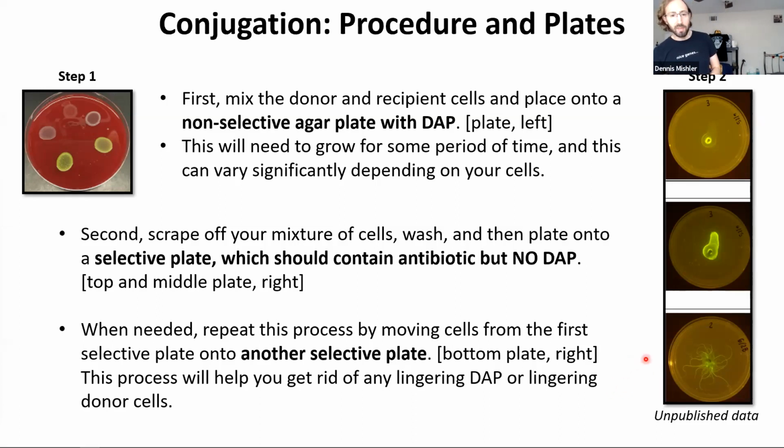This conjugation procedure, what my students did, probably took them about a week to conjugate. But none of our transformation procedures work, so that was the only option they had. Transformations didn't work, so we had to conjugate. It takes longer, but hey, we got a good result.